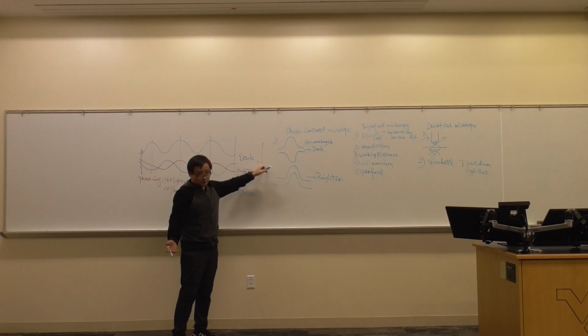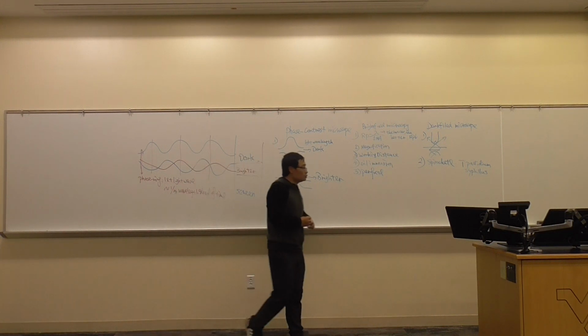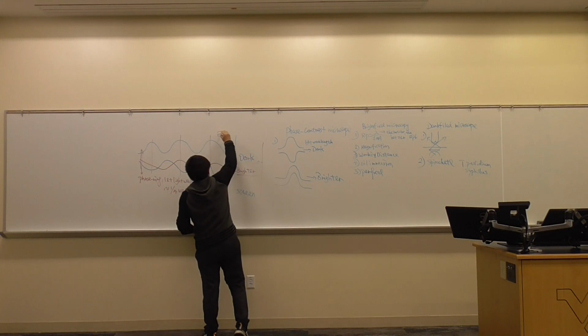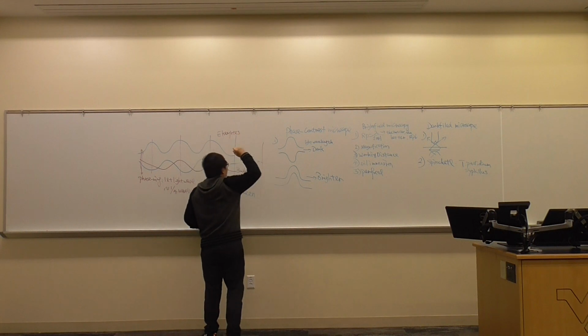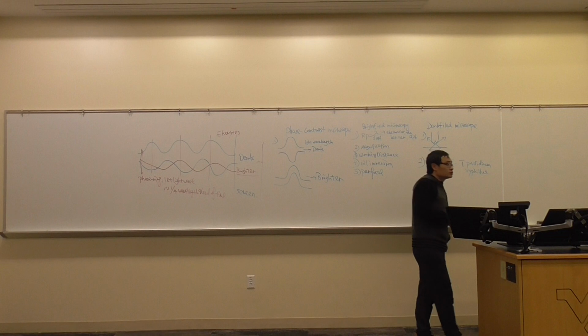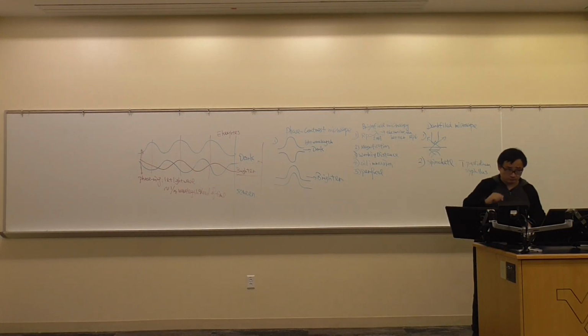But why do we want to do this? This is used for lots of eukaryotes. For microorganisms, if it is eukaryotes, sometimes it's difficult to do the staining.